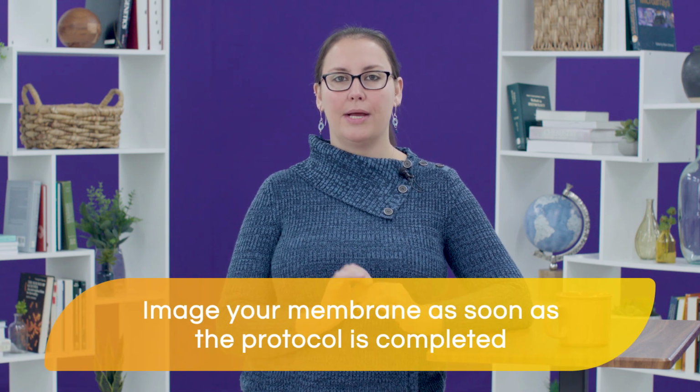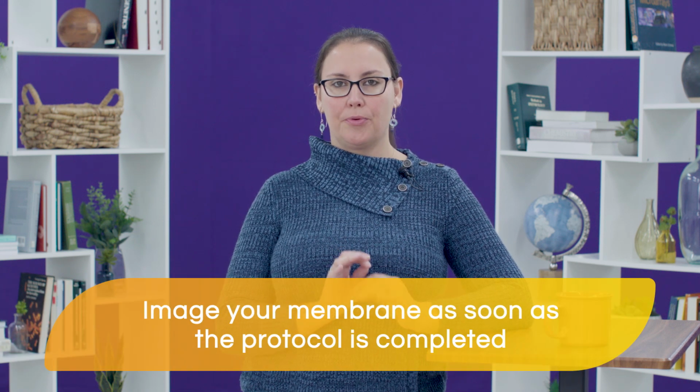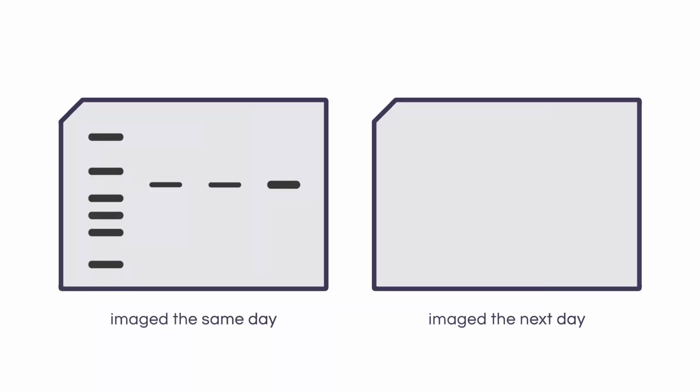The enzymes that we use to label our secondary antibodies are not structurally stable at room temperature, and that's the reason why we recommend that you image your chemiluminescent Western blot membrane as soon as the protocol is completed. Meaning that as soon as you're done with your secondary antibody incubation and the subsequent washes, you go ahead, add the substrate, and acquire your image. That's going to help ensure that all of the enzymes that are present on the membrane are still active and capable of producing photons of light, increasing data accuracy.